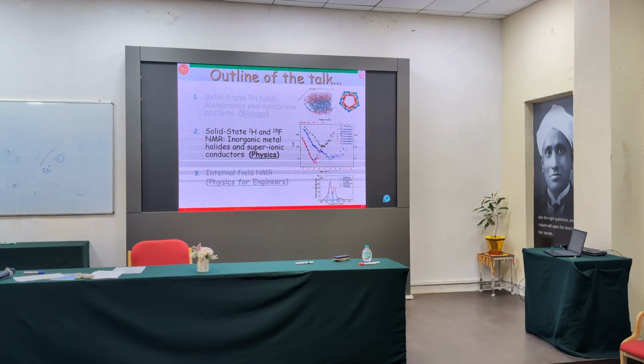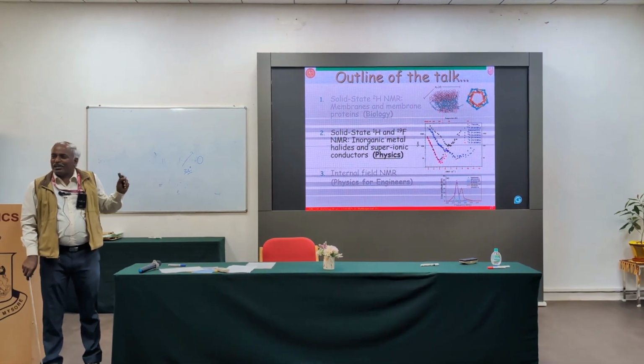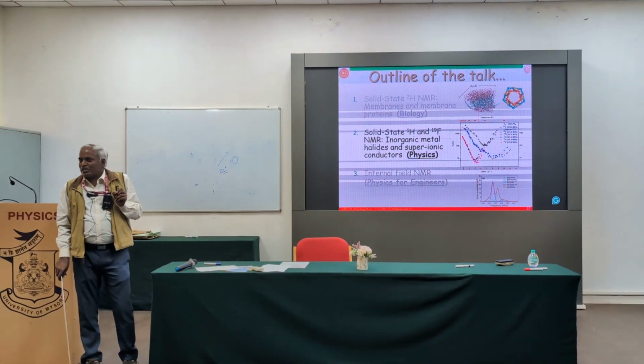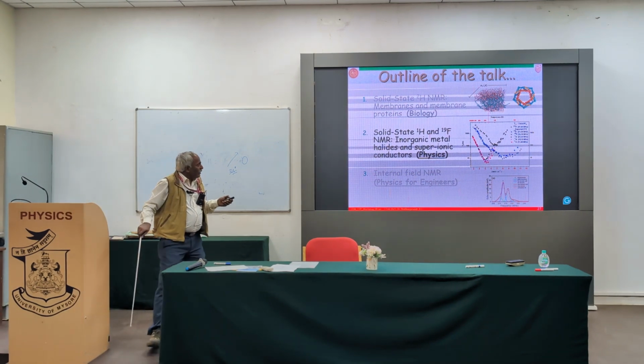With just that correction: though I have been in this NMR field for the last 20 plus years, 25 years, I never recorded any spectra with respect to chemical shift or anything. It is completely solid state, meaning this type of solid state NMR. Though we operated that kind of spectrometer, we never did that.